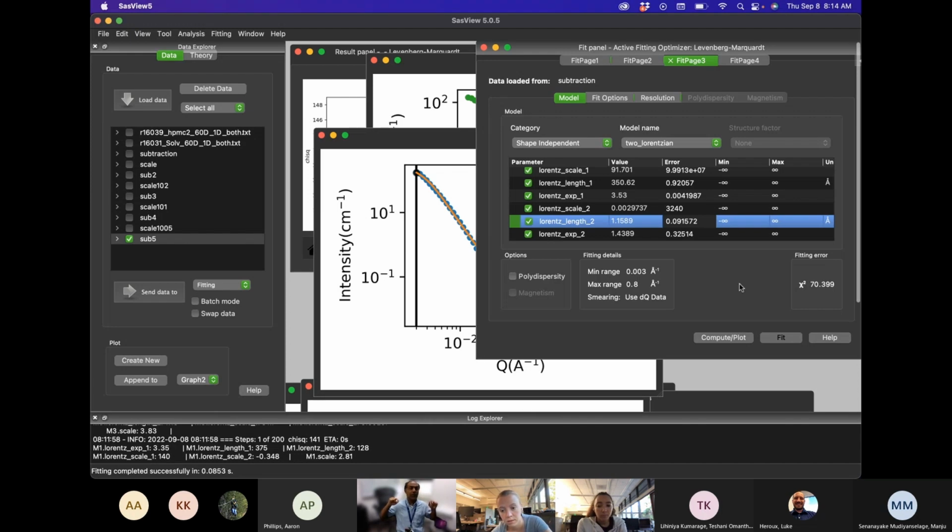So if you're doing a peak fit of a Lorentzian, you have a peak and it's the way you come down, right? Same way you're inverting and you're creating that curvature, and you're picking out what is the length and what is the slope of your fall.